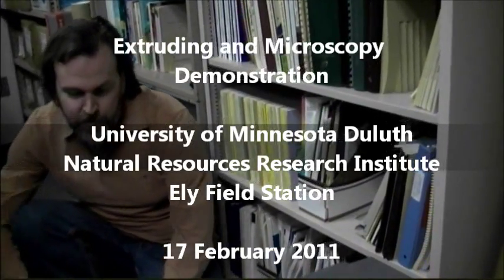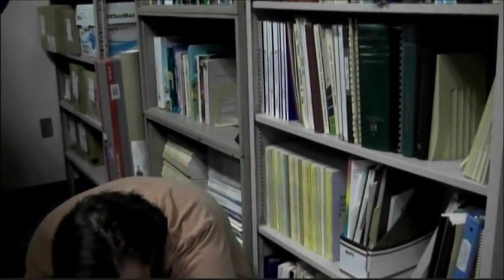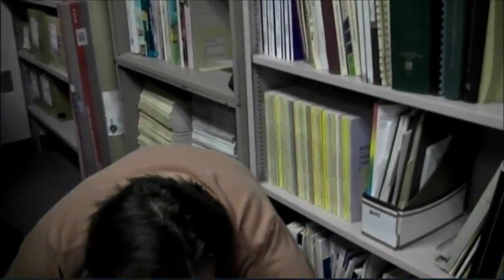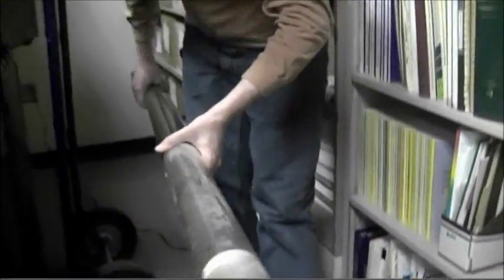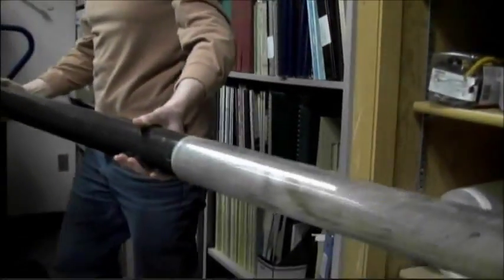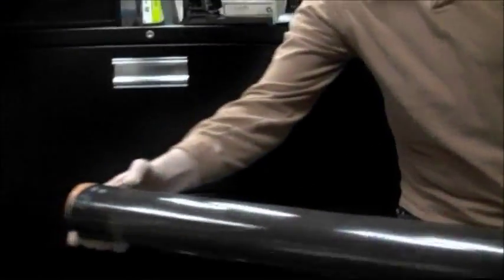We are going to extrude the core that we collected yesterday into one centimeter intervals. See, it's still nicely intact, well stored with that Zorbitrol.